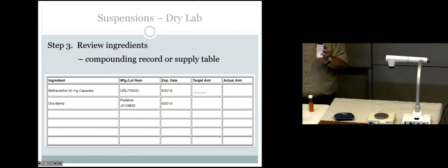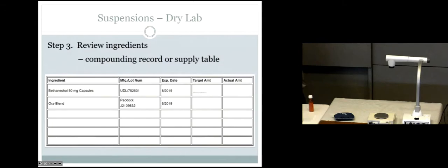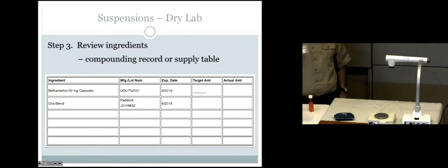The one that's close to that you just need to be aware of, if I put out simple syrup, is, again, a syrupy, sweet flavoring, but not imparting a specific flavor. Okay? So these are 2 that make it palatable, but not flavored. If you want to impart a specific flavor, you would use something like cherry syrup. So what do you think cherry syrup tastes like? My favorite, by the way, if that was on the test, just so you know.